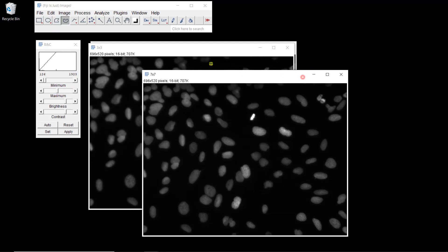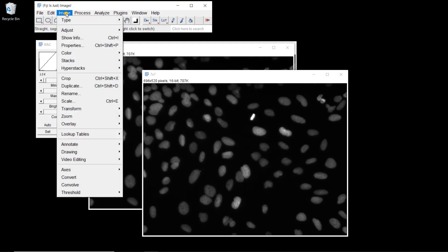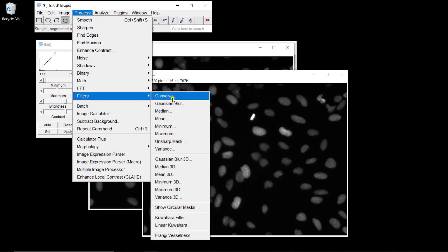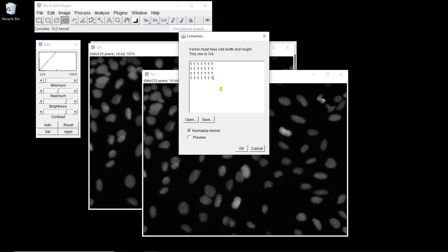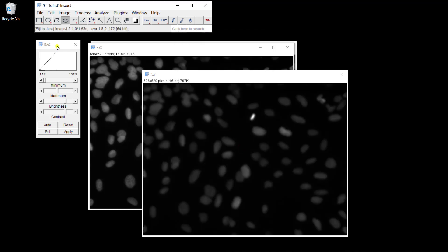Let's do the second convolution with a 7 by 7 kernel. Again, you go to Process > Filters > Convolve. Instead of 3 by 3, it's going to be 7 by 7. I'm going to fill a row of 7 ones — you can also copy and paste to go faster. On top, it tells you the size of your kernel: 7 by 7. It's not always easy to know where you are, especially if you have different numbers, but here you can just see it's a 7 by 7 kernel with ones everywhere. Let's apply this one and adjust the intensity.